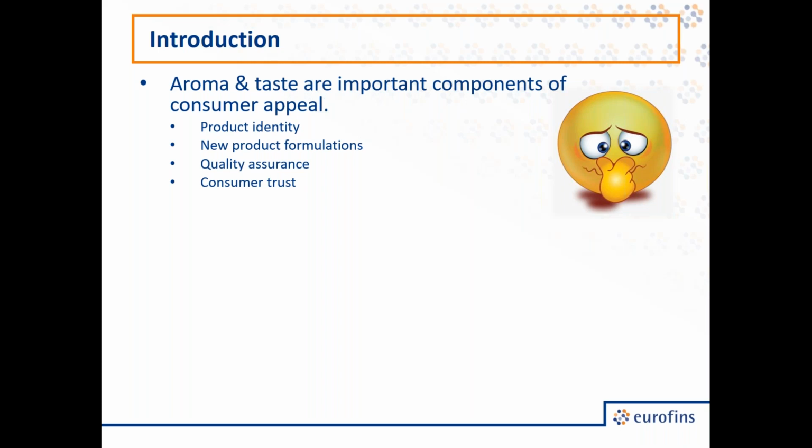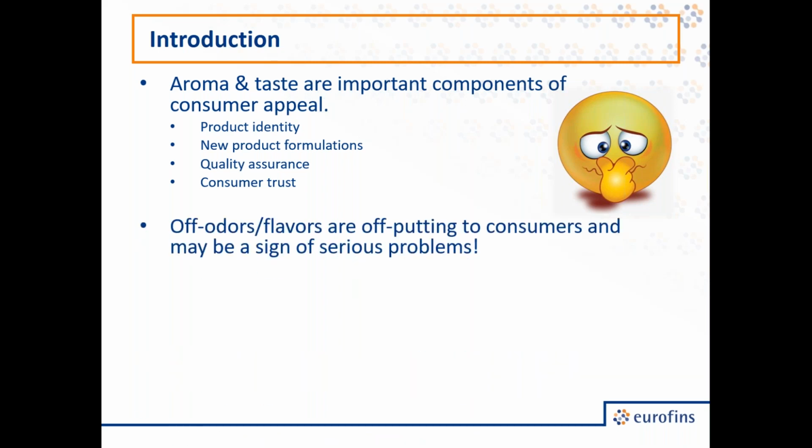As well, the flavor of a product can be important in quality assurance, as off odors and off flavors can be indicative of issues with a product. And finally, flavor is an important part of consumer trust. Consumers want to know what they will be purchasing and that they can get the same consistent product every time. And so off odors and off flavors are not only off-putting to consumers, but they may be signs of serious problems.